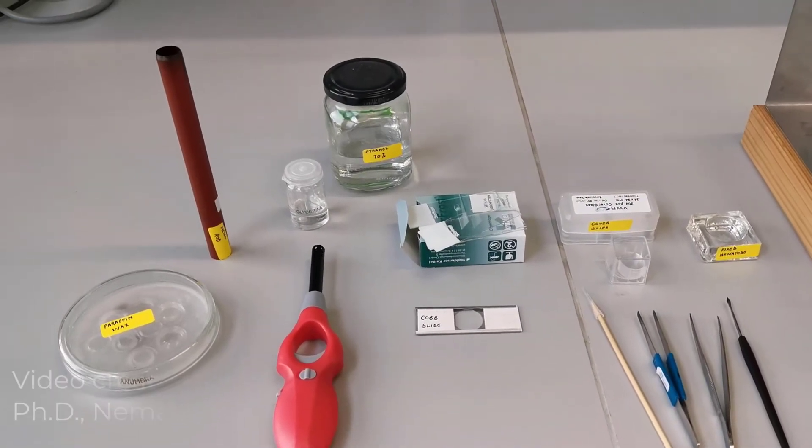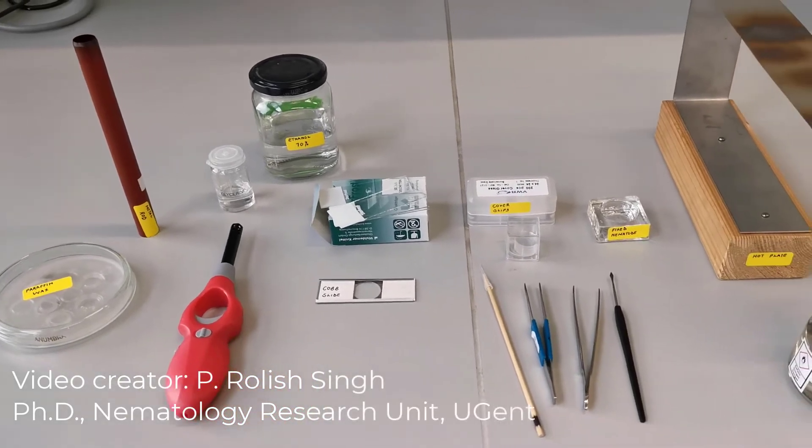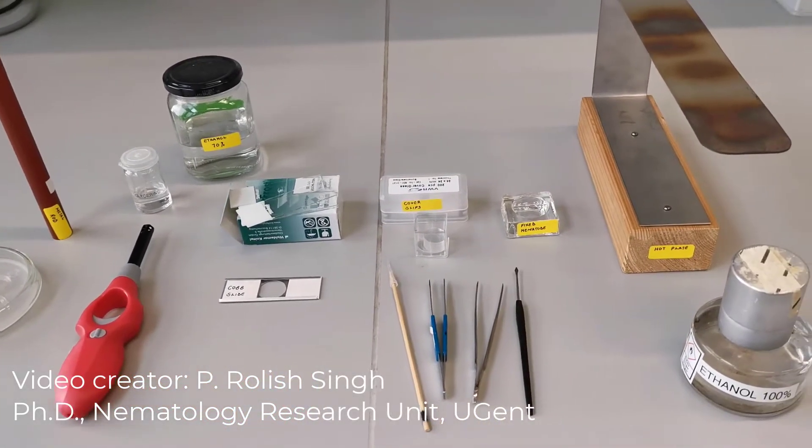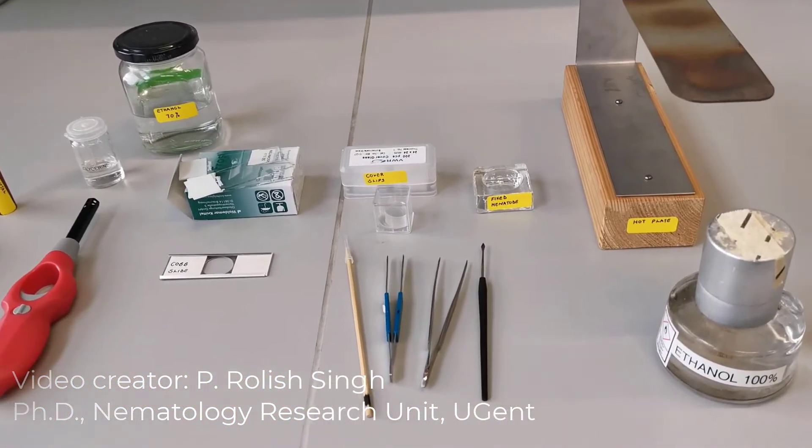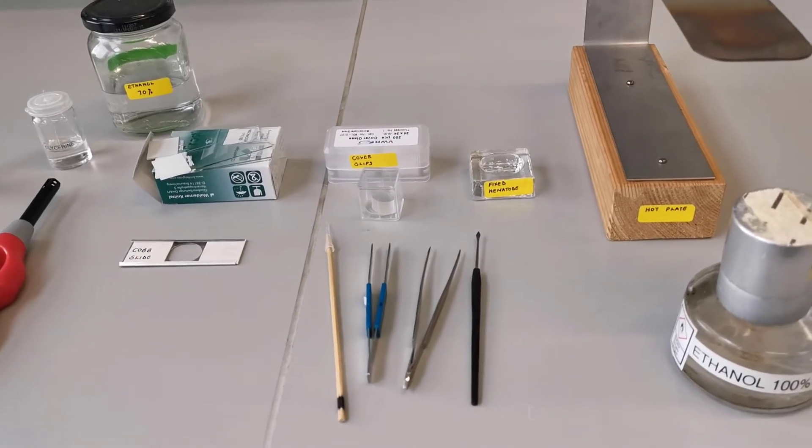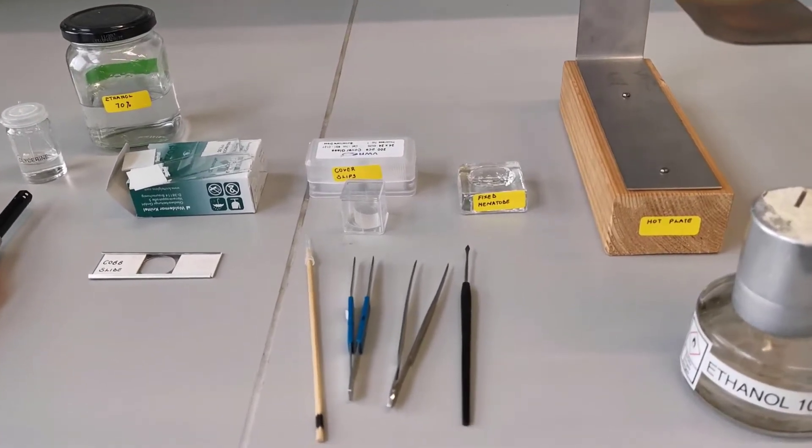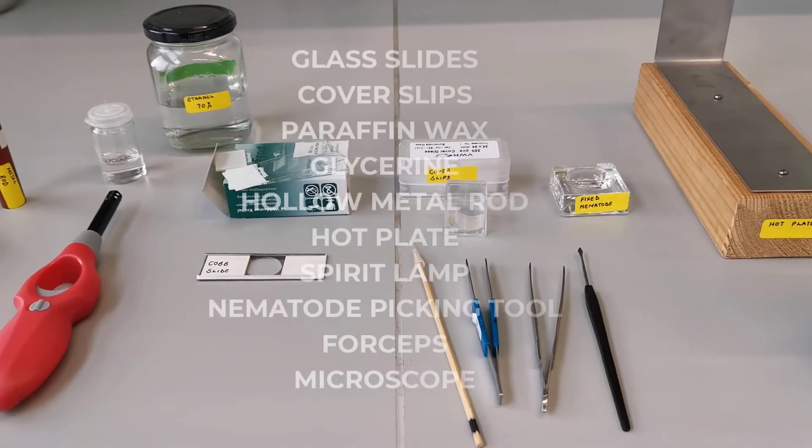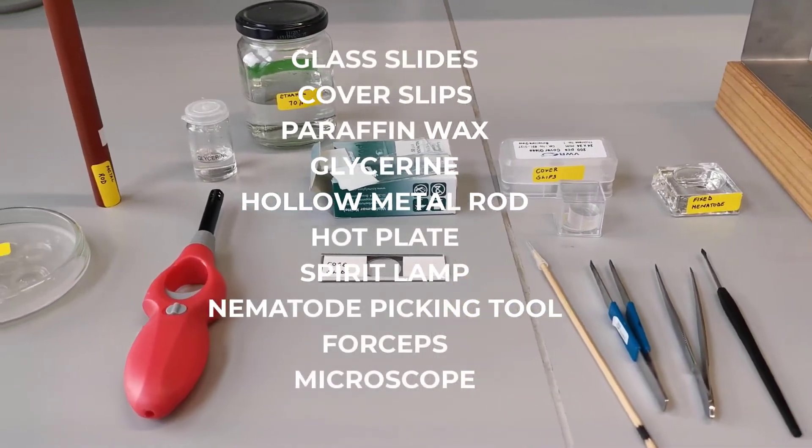Fixed nematodes are usually mounted in glycerin medium on glass slides or Cobb slides. In one of our previous videos, you have seen how to fix nematodes using 4% formaldehyde. In this video, we will learn how such fixed nematodes can be mounted on a glass slide in glycerin medium.